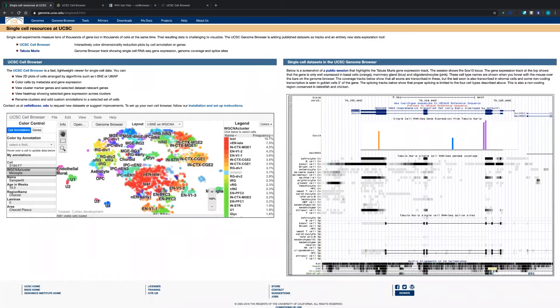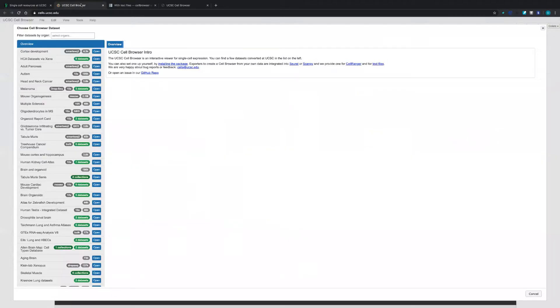Hello everyone. This video is a brief introduction about how to use the UCSC Cell Browser. The UCSC Cell Browser is a fast, lightweight viewer for single cell data. UCSC has already provided a few sample data sites you can play with when you first use this tool. When you get familiar with it, you can generate your own using your own data.